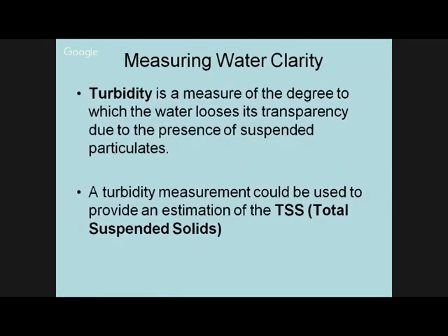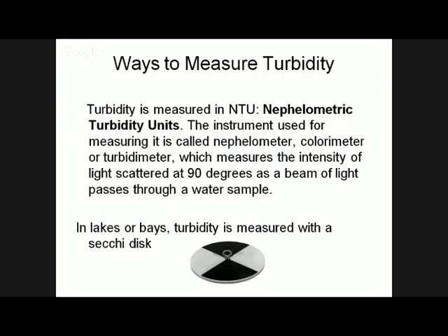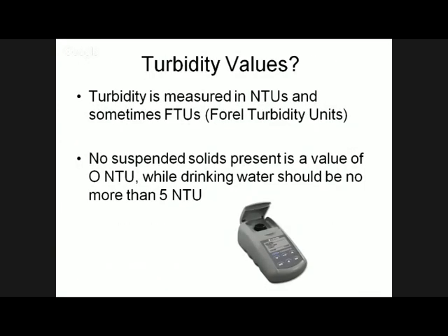Then turbidity is another parameter. This also shows the presence of TSS. This is analyzed by an instrument, a nephelometer. The values are in NTU. In NTU, you can indicate these values.